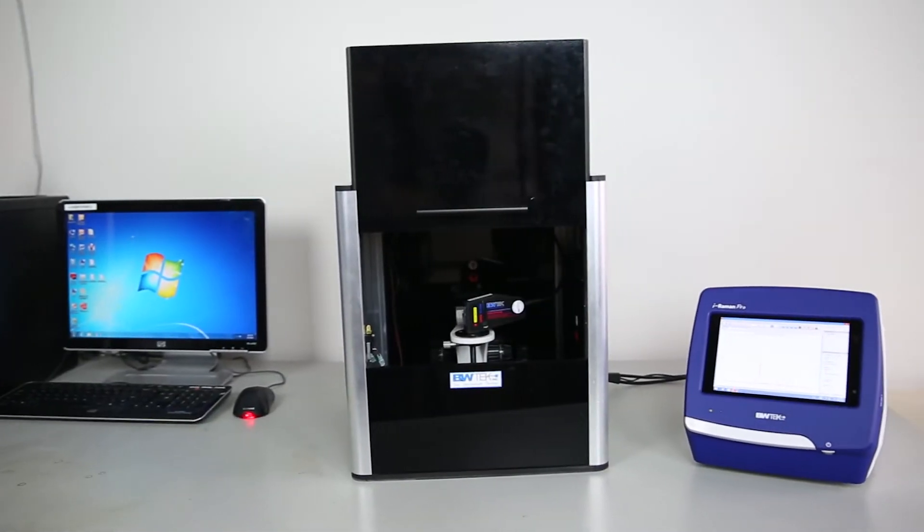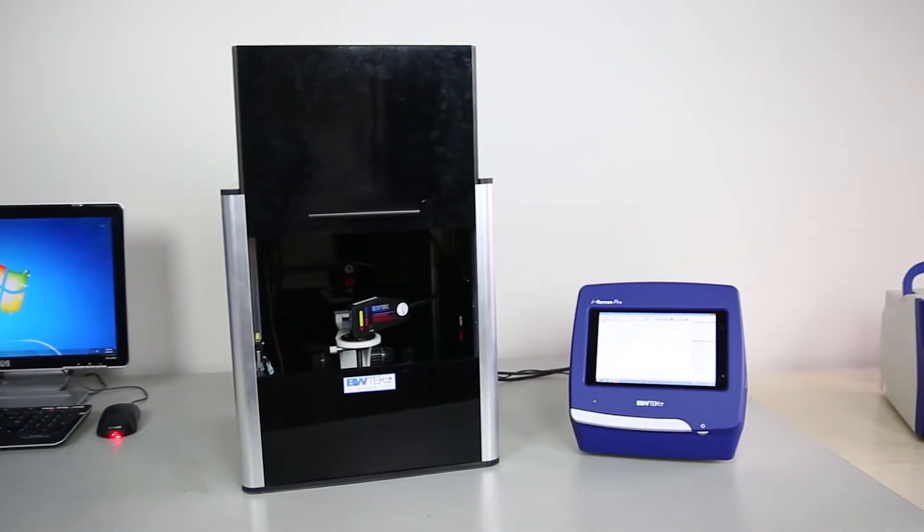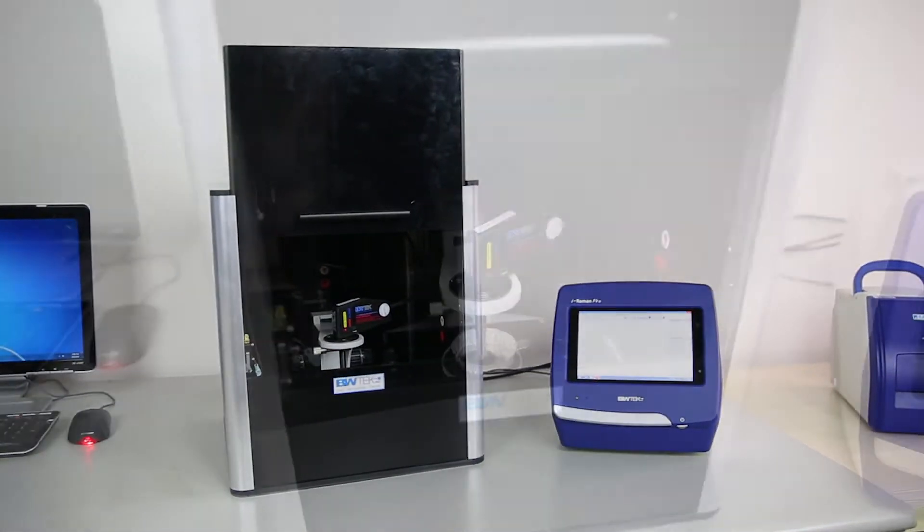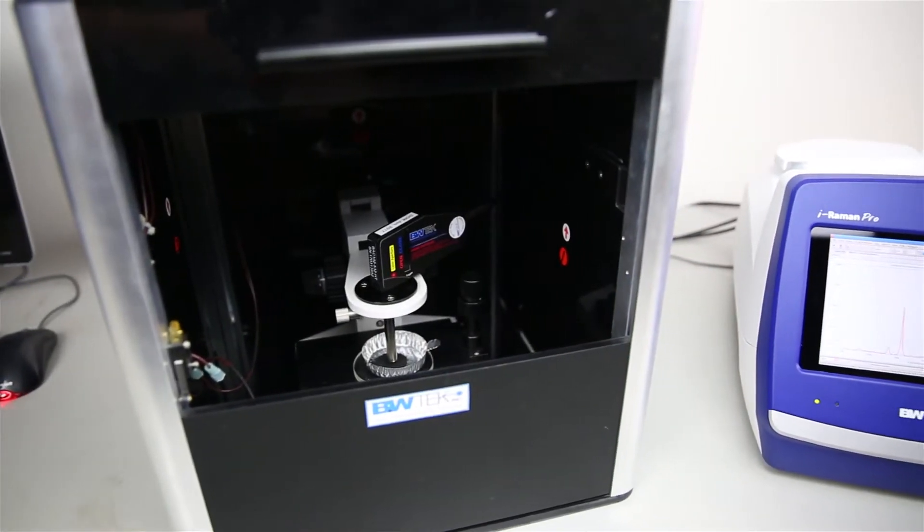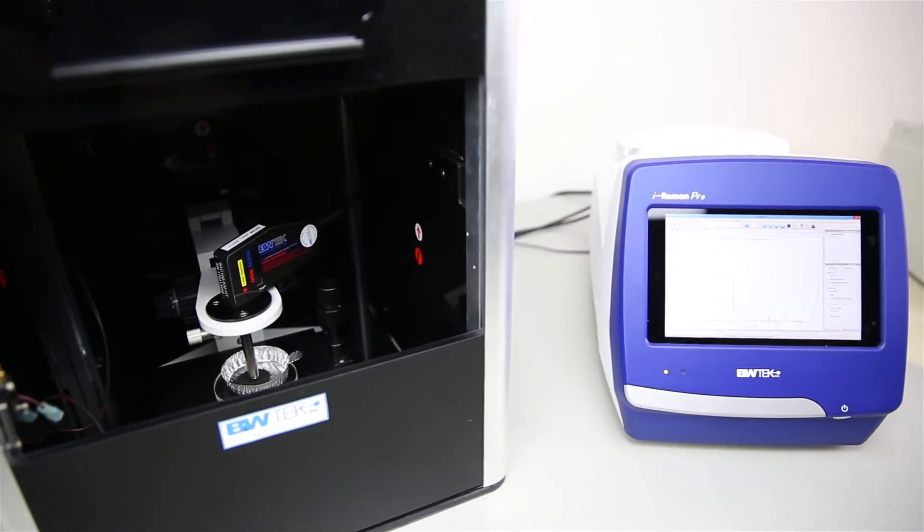The Carbon Raman Analyzer from B&W Tech is optimized for measurements of carbon nanomaterials and is perfect for non-destructive at-line process monitoring and materials characterization.